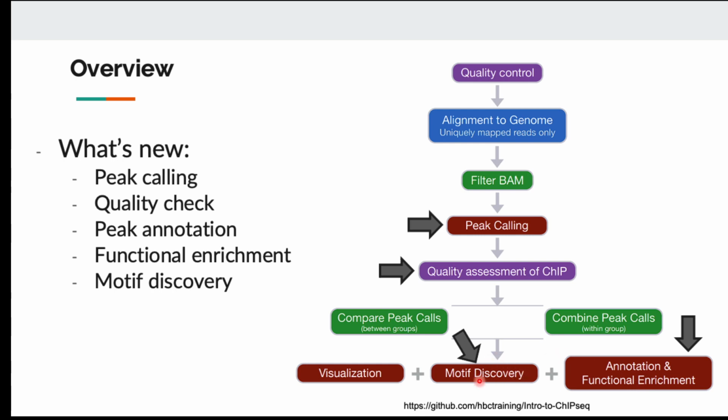The second thing we want to analyze is, for a transcription factor, if it binds to a certain location on the DNA, what kind of DNA pattern, what kind of DNA motif does the transcription factor recognize? Like, does it bind to the TATA box, like TATA, or other patterns? We want to understand these two things. So in today's lecture, we are going to finish with these two analysis goals. Let's start with the processing first, like with peak calling.